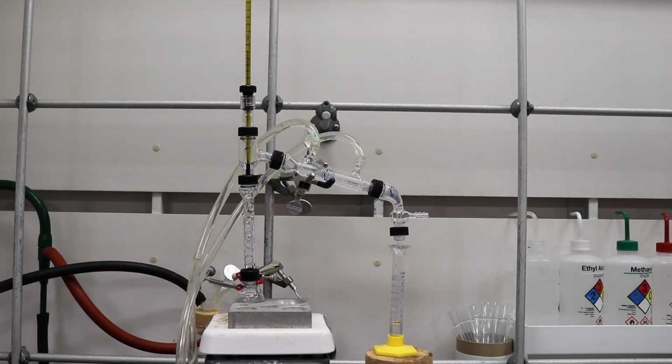Fractional distillation will take a little bit longer than simple distillation because there's a longer pathway that is needed for the compound to travel. Because of this longer pathway, fractional distillation is sometimes a more accurate method when you're distilling compounds with two liquids that have close boiling points. But as you can see here, we just are sitting and waiting for our distillation to come over. And at every half mL, we will record the temperature.